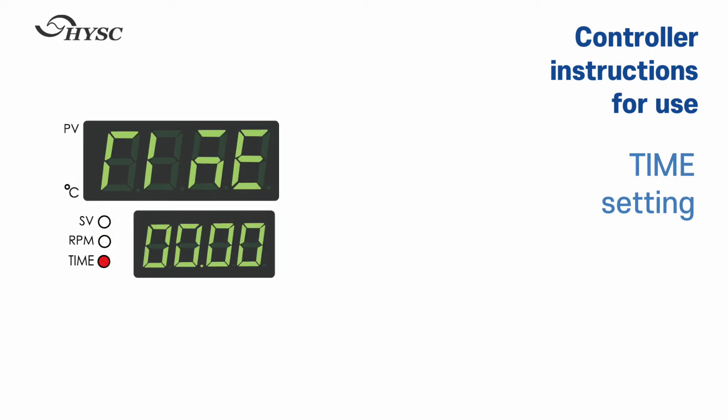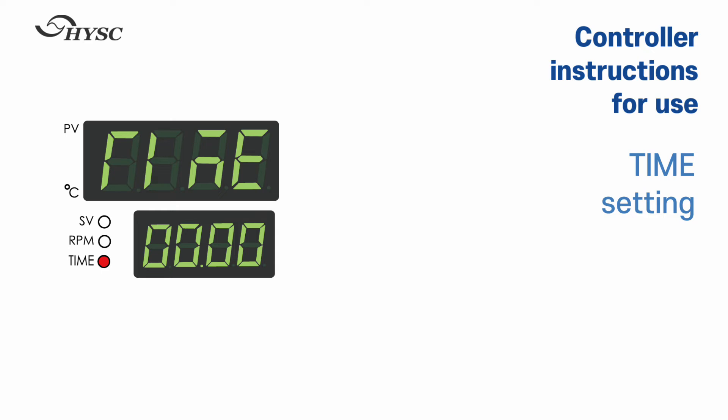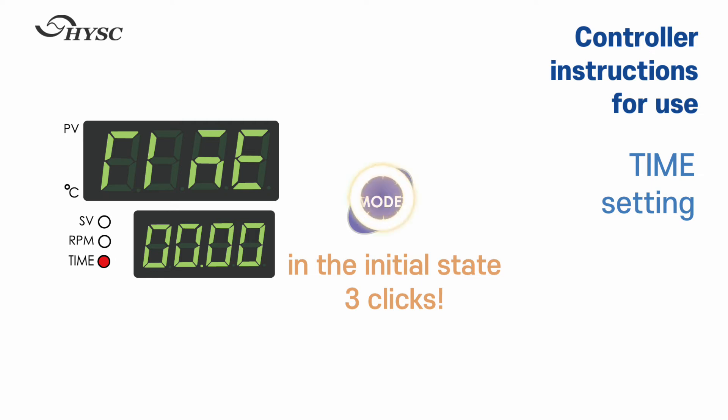This is a guide for time setting. After setting the RPM, press the mode key once again to set the time. Or press the mode key three times in the initial state to set the time.